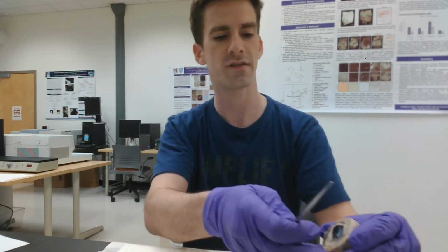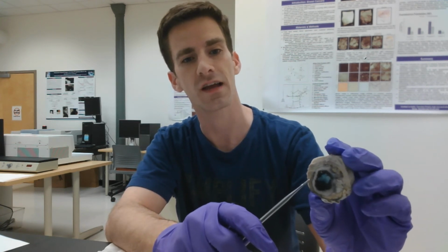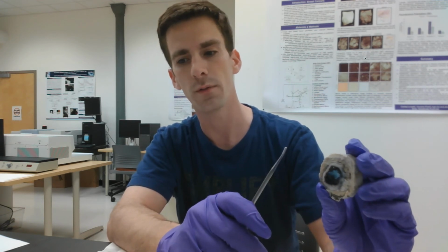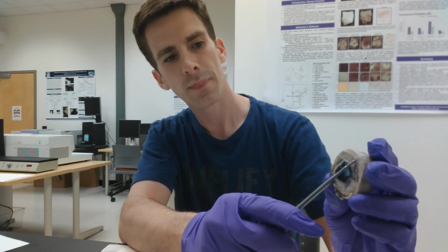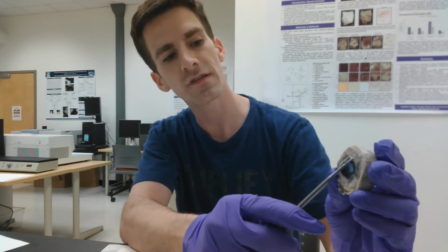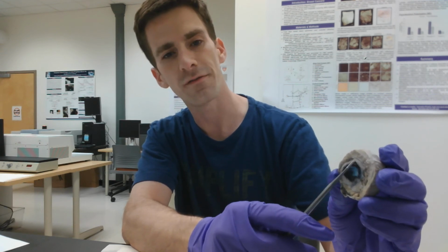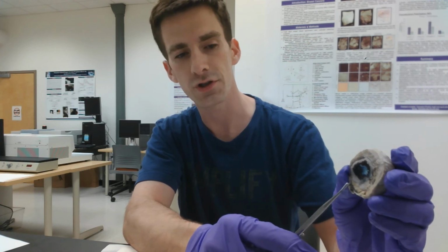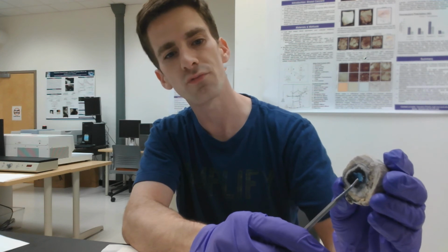So now we're going to examine this portion of the eye, which is the posterior segment of the eye. And you can see several outer layers of the eyeball. The outermost layer here is the sclera. It is made of tough connective tissue. Interior to the sclera, here I'm pointing to the choroid. The choroid is the vascular layer of the eye, and it also contains some connective tissue. And then finally here, I'm pointing to the retina.